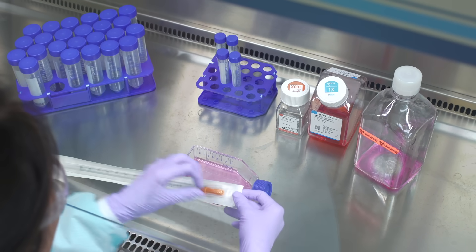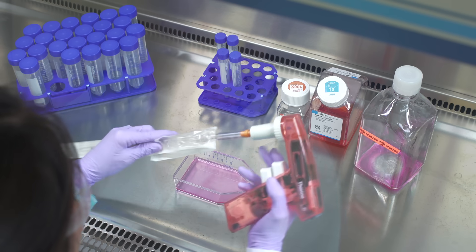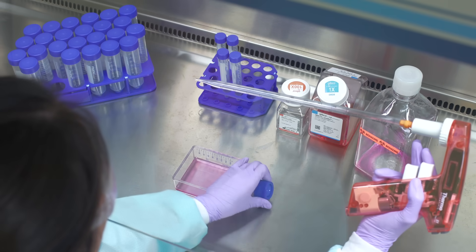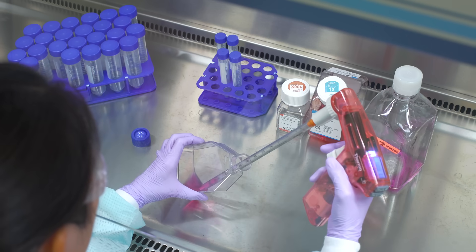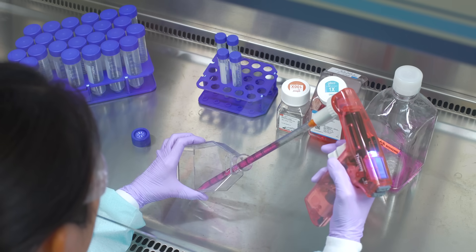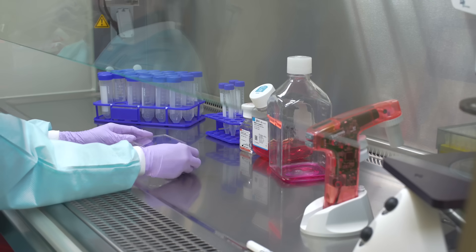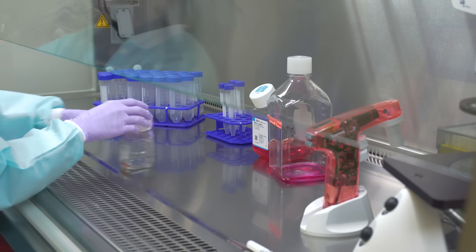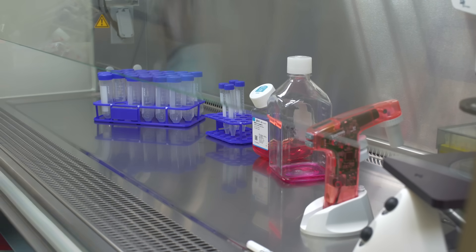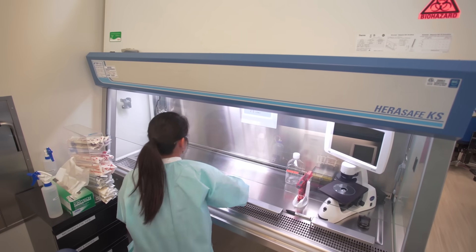When passaging cells or changing their medium, the basics of aseptic technique are the same. Only open the containers in the sterile field. Do not cross your arms or other items over an open flask. Don't rush, but work at a good pace and with deliberate motions. Do not reuse pipettes and do not use items that were inadvertently contaminated. When finished, make sure everything is closed tightly before removing from the cell culture hood. Anything opened outside the sterile field will now be non-sterile and should not be used for cell culture work. Wipe down the work surface with ethanol again and straighten up the hood before you leave.